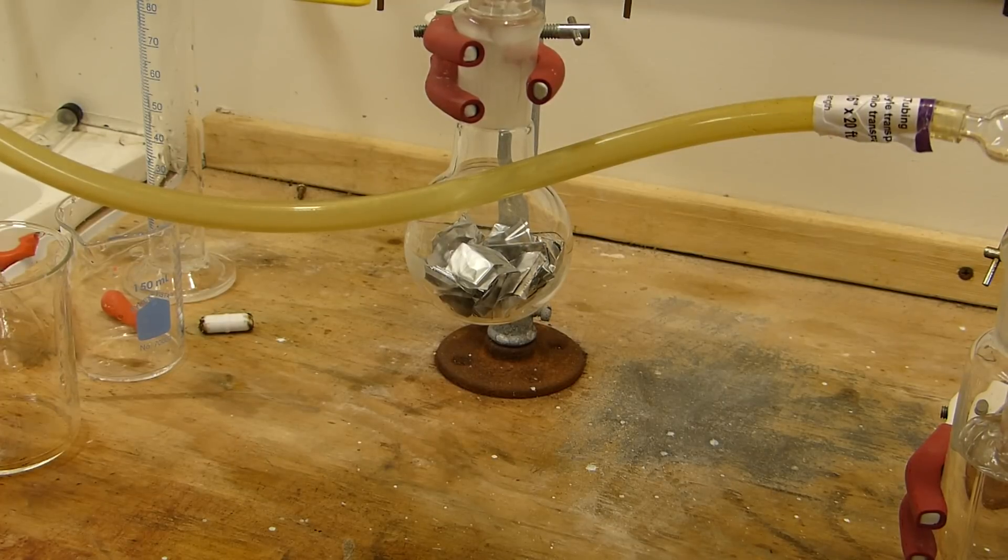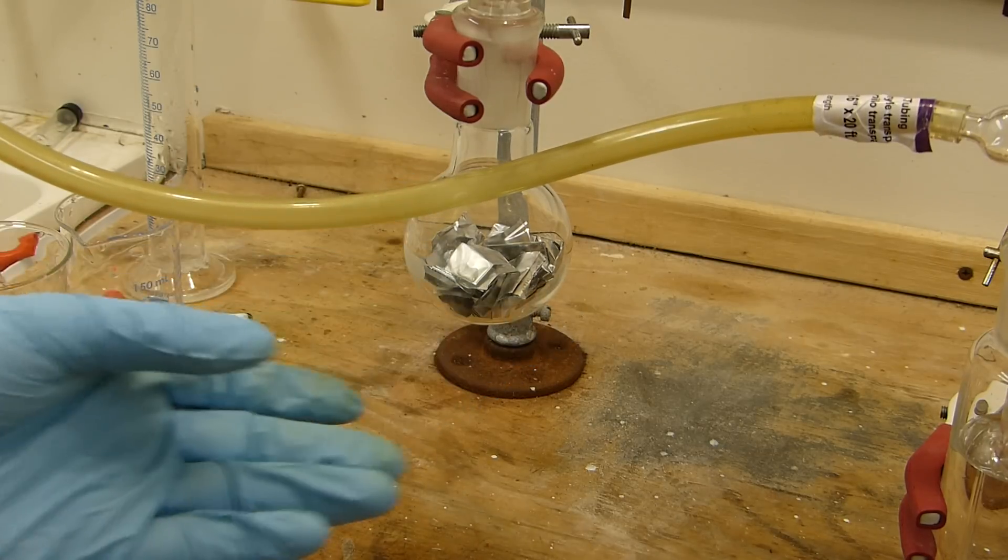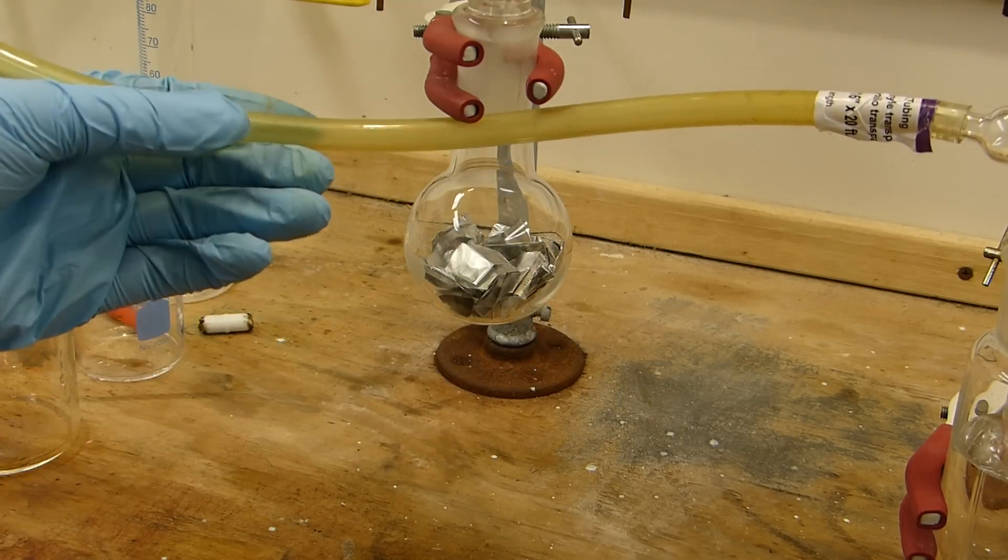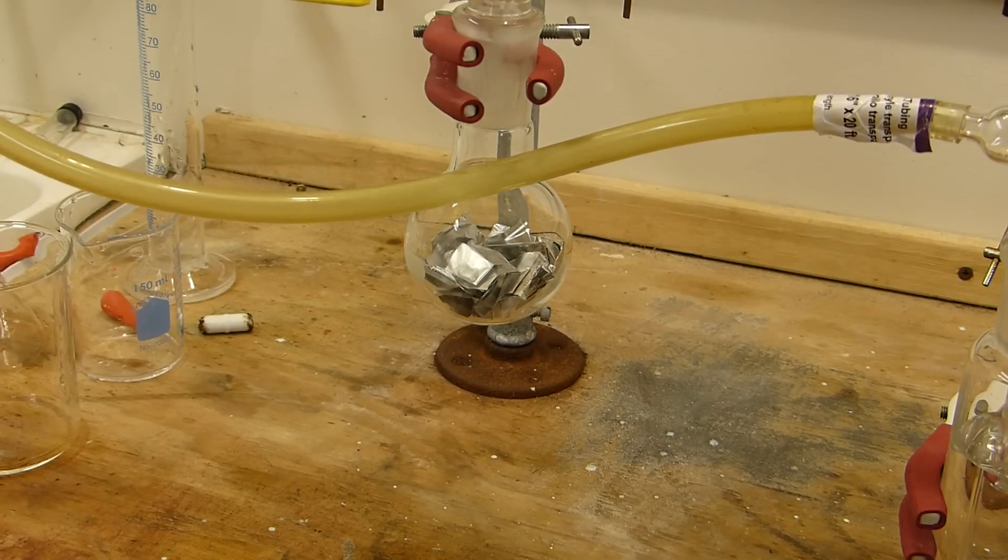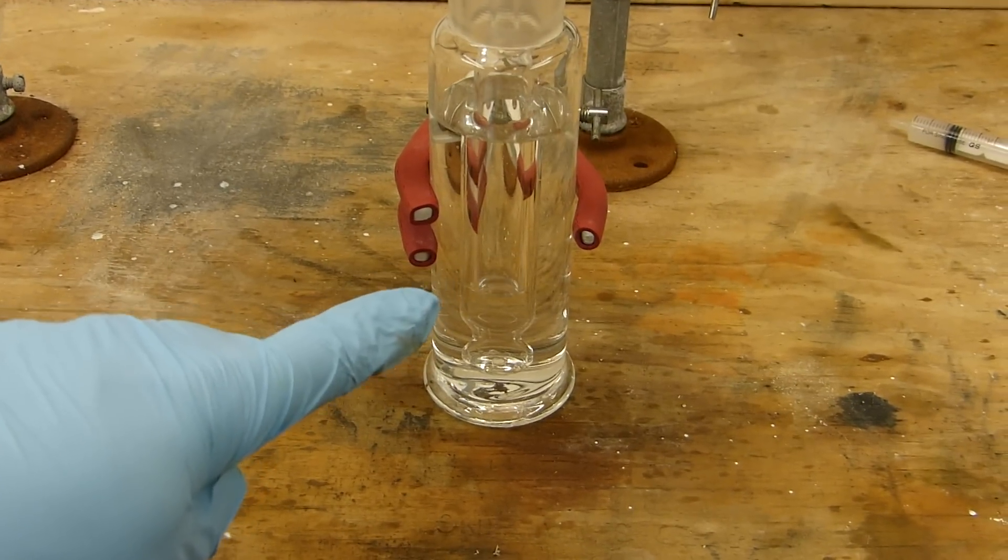This reaction also has an induction period. It takes a second for this to warm up and break through what I believe to be not only the oxide layer on the aluminum that forms spontaneously but also a polymer layer which is on the aluminum foil. But after a second or so this will get going, and you can see the gas wash bottle, we're producing some gas.